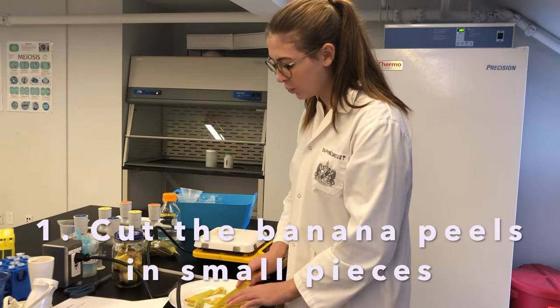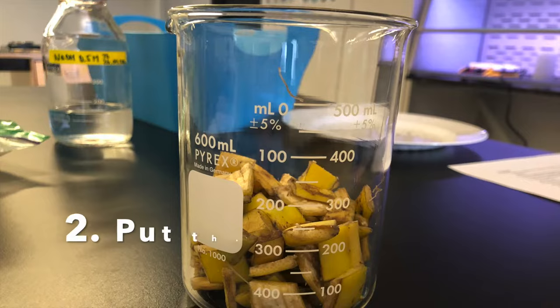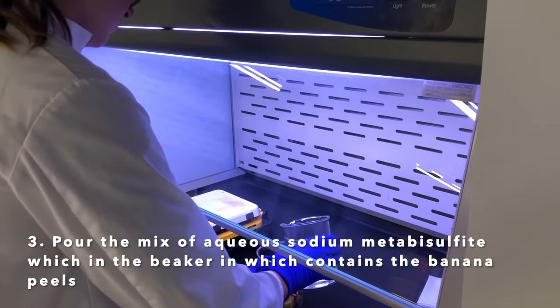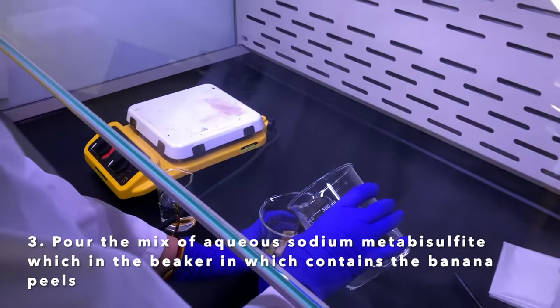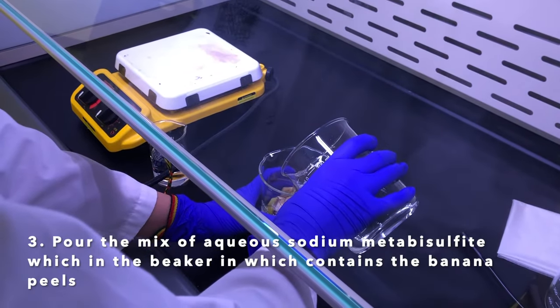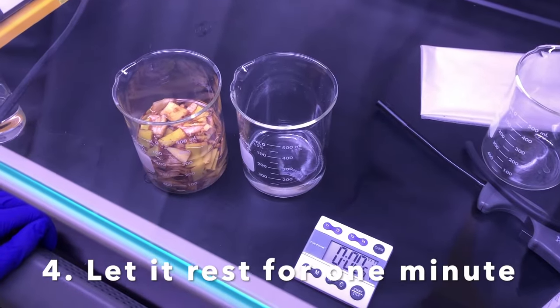For the first step we're going to cut the banana peels into small pieces. Here Marianne is under the fume hood and she's going to pour the Na2S2O5 into the banana peels. We're going to have to wait a minute until it all reacts together. This is what it looks like.